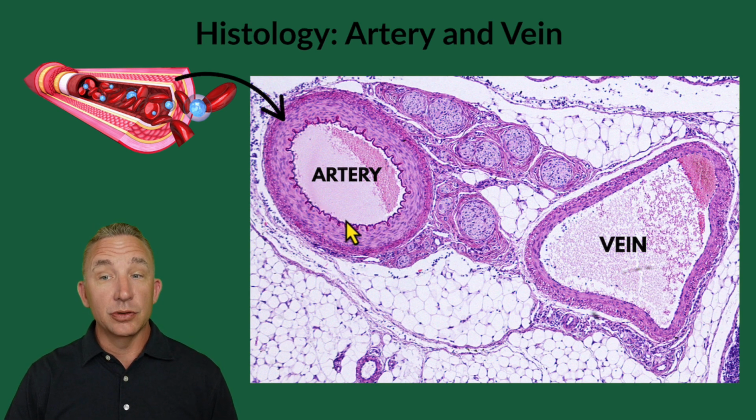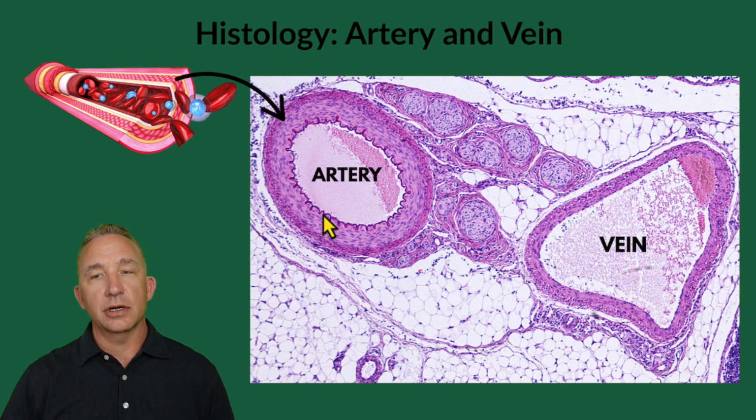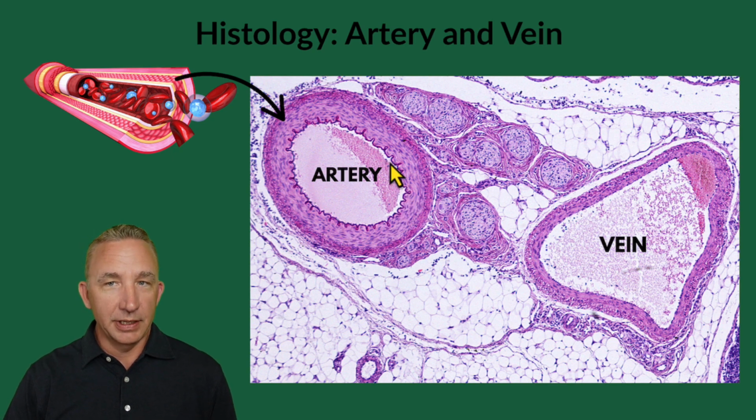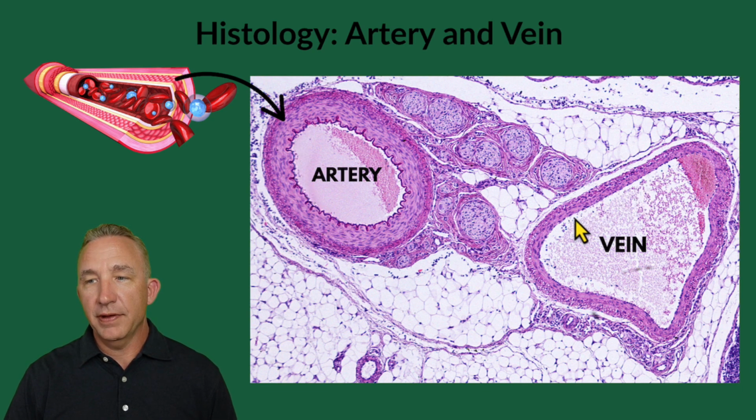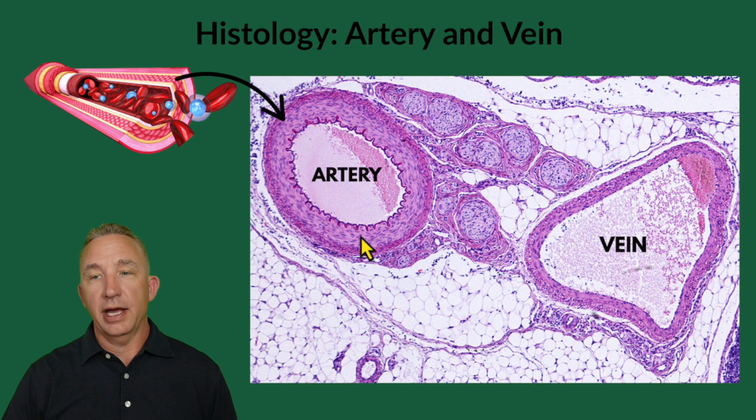This type of tissue is simple squamous epithelium. So we start to see you actually have three types of tissues in our vessels. First, starting with an epithelial tissue, and there'll be a basement membrane of connective tissue underneath to stabilize it. But this first layer, tunica intima. So if I just go where the blood would touch on the vein, this would be tunica intima or tunica interna. Next, I just look for a change.